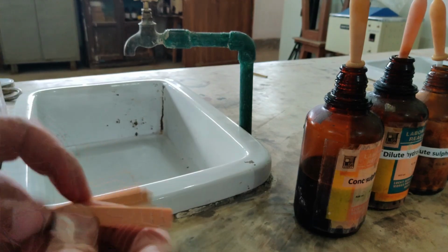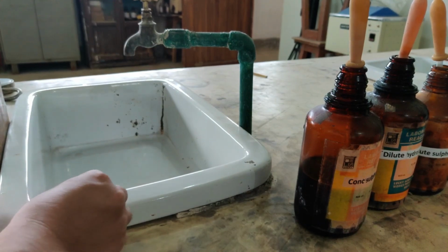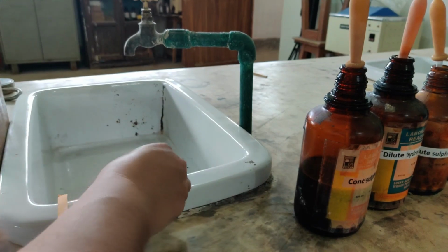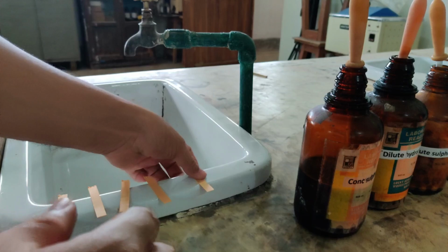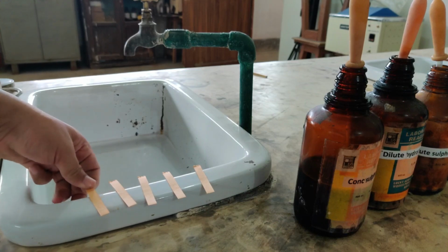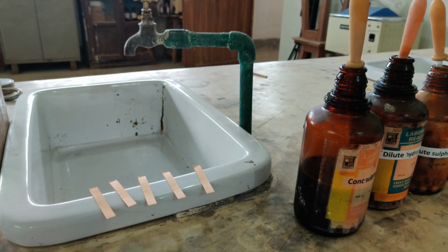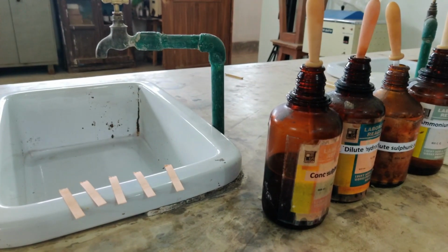So I am going to peel off 5 strips, and let me keep it here so that we can directly see the color changes. So let me keep one here, second one here, third one here, fourth one here, and fifth one here. So here are the 5 strips, and I am going to test these 5 strips of paper by using different solutions. And again I should tell you that since the pH of the different solutions which I am going to take are different, yeah, the pH of these are different, so we will see the color change also will be different.